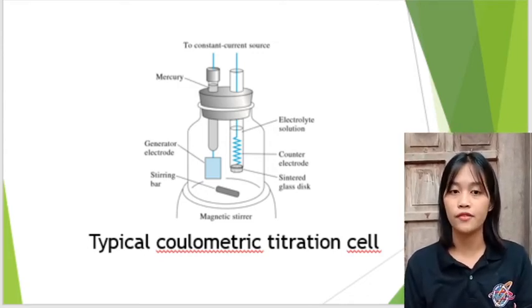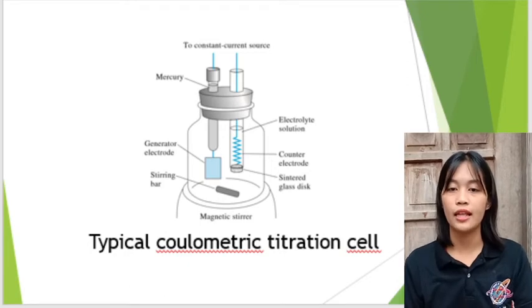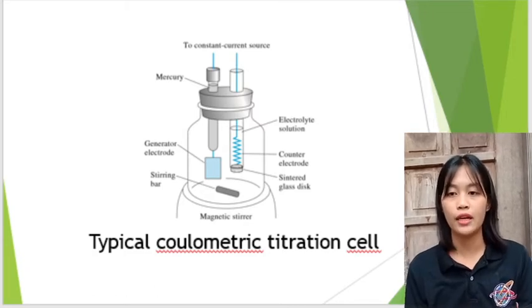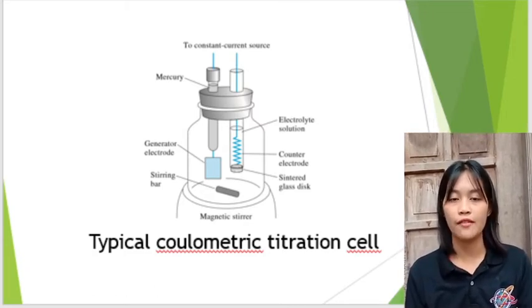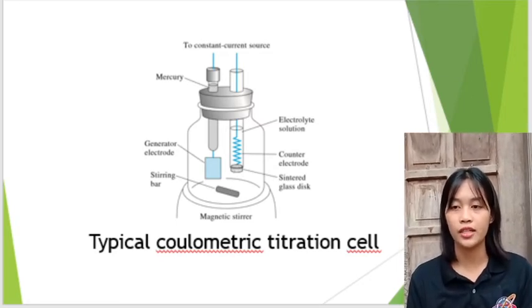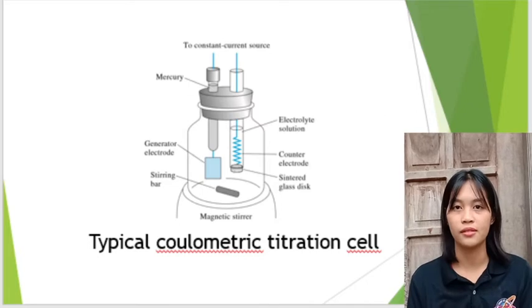An alternative to isolation of the auxiliary electrode is a device in which the reagent is generated externally. The apparatus is arranged so that the flow of the electrolyte continues briefly after the current is discontinued, thus flushing the residual reagent into the titration vessel.